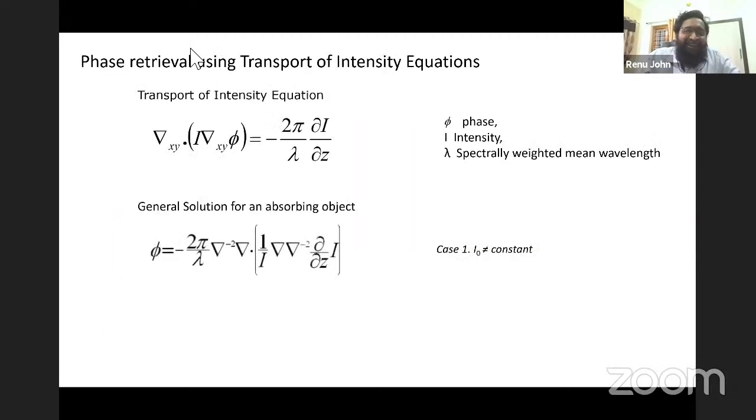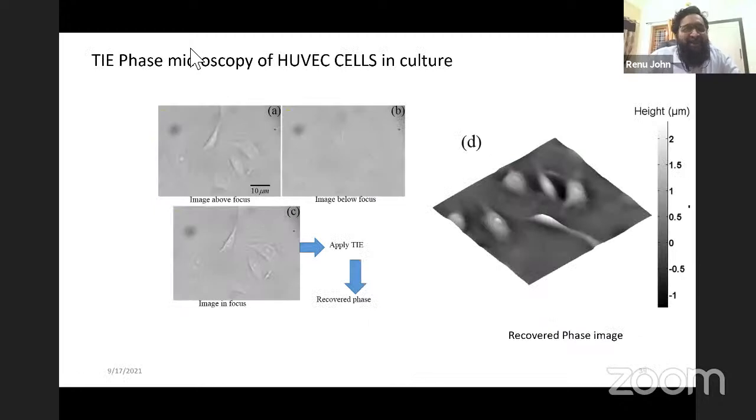These microscopes are so cheap that if I tell the actual BOM, people will laugh at it. I have microscopes which are as cheap as 1,000 rupees to up to 1 crore. These are very cheap microscopes. In fact, I automated the stages so that I can do automatic slide scanning. I put two stepper motors on it so that it can do slide scanning. If you remove that, which was the only expensive thing, otherwise it is just a microscope objective and an LED, and that's it.